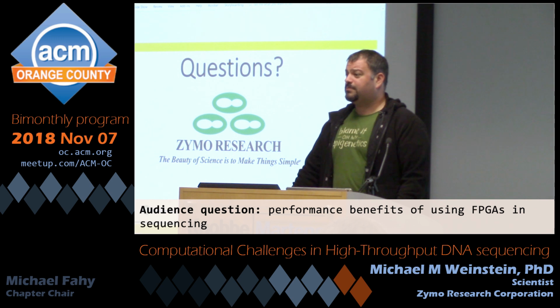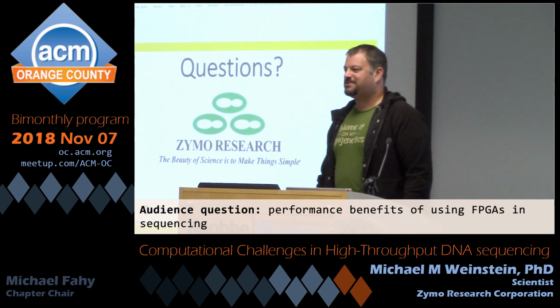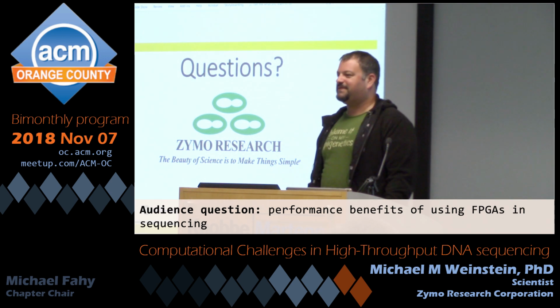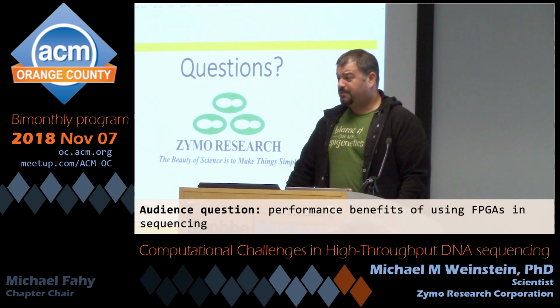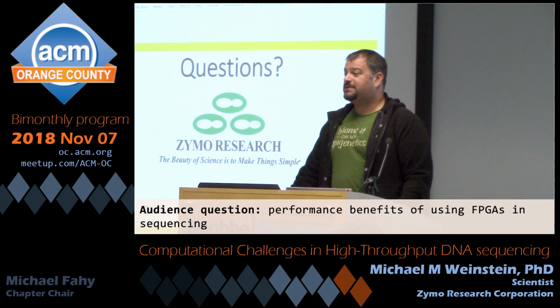Yeah, their little device hauls ass. It's amazing. Yeah, FPGAs are very impressive. So, fundamentally, if you can get your operation onto an FPGA, it's going to probably be very, very fast. The challenge here comes with getting it on the FPGA because that makes it very hard to code. But yeah, I've seen a demo of their thing.